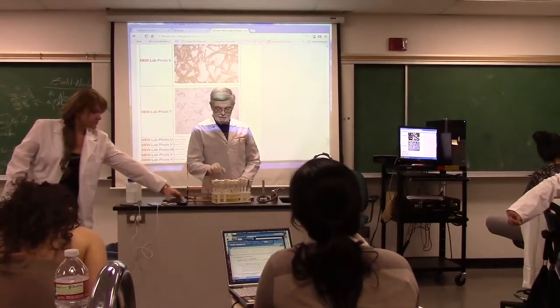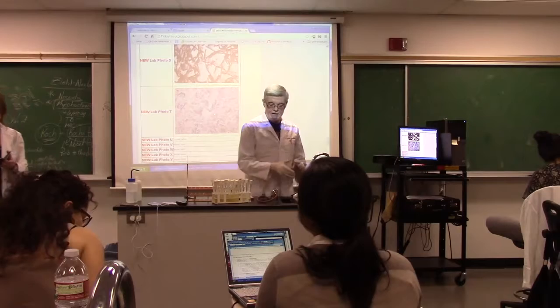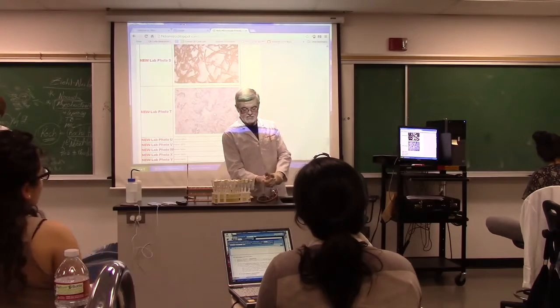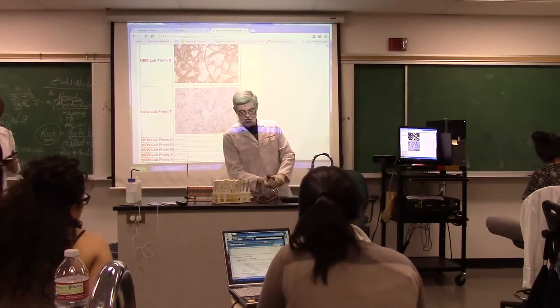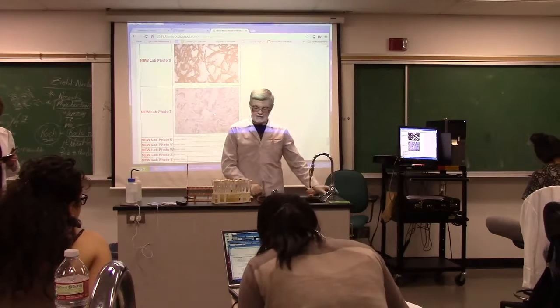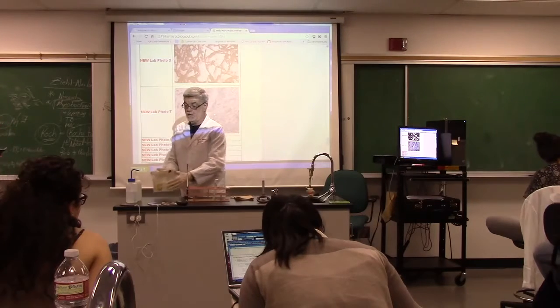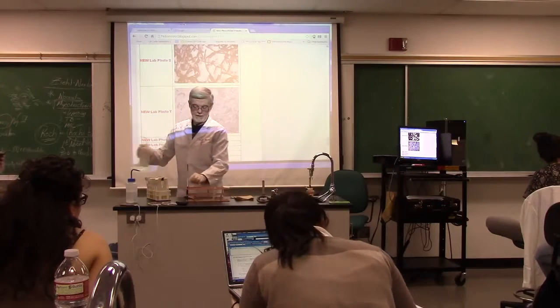So I have my little clean slide here, and I'm going to make my smear. At first, I was going to make my smear before I even started, and then I thought, oh my gosh, you won't even see how hard it is to get the smear, because this thing is full of lumps.